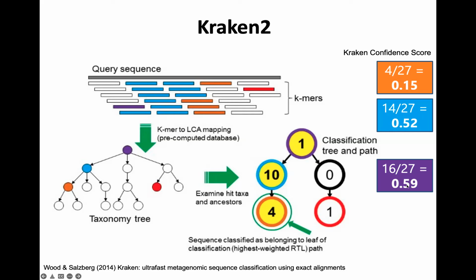Now, Kraken 2 actually has a nice option in there; there are options of different things you can turn on. By default, the confidence score is 0, right? So we get basically this assignment down here. Okay, and we'll show you that that's probably not great. It leads to false positives. But if you up that to a cutoff of, say, 0.2, then anything below that's not going to be included. And so we would call it at this blue node, a bit higher level, but with more confidence.